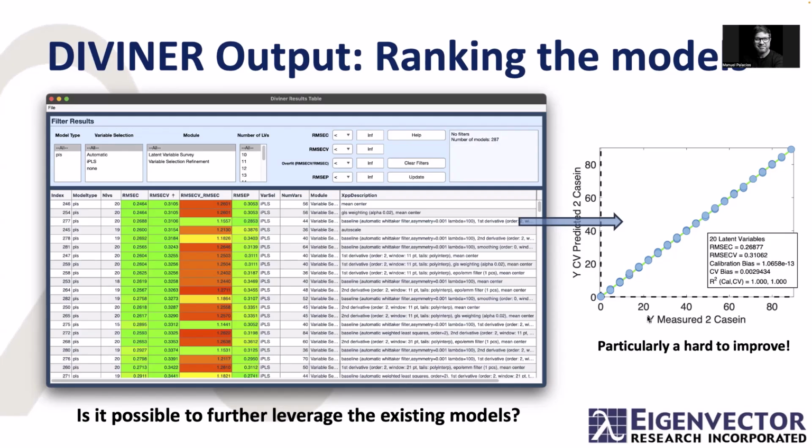We usually try to find what works for the data. And now it is nice because we have a UI, and that helps a lot. I don't have to be coding that much anymore. That's one of the great things, that we now have this nice way to still have good information about what we are doing with the data, and build all these models.